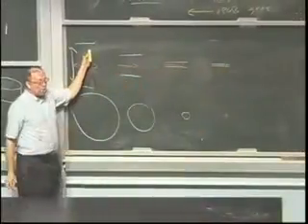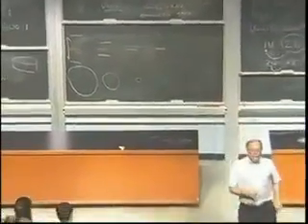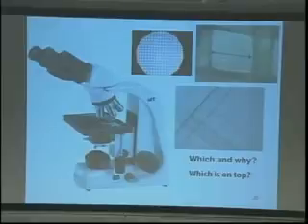So when we first look at the specimen, we will use the coarse focus, which is the big knobs at the bottom, the coarse focus knobs, to raise the stage. So what we'll do is we'll have the lowest power objective in place first. Why? Because it gives us the biggest field of view to find the specimen and the biggest depth of focus.